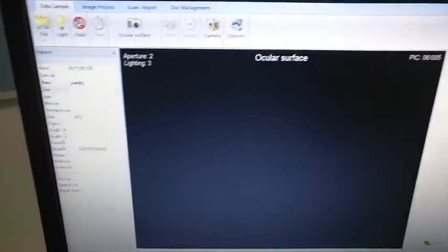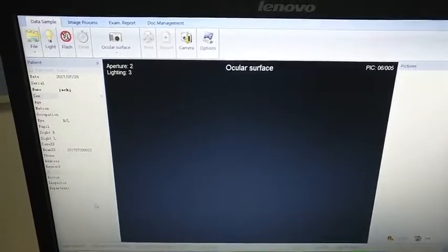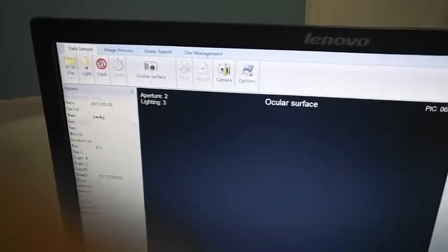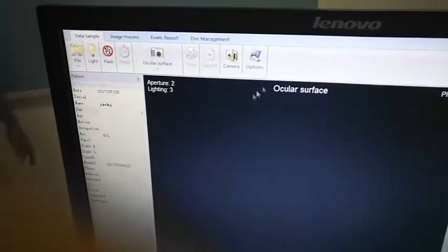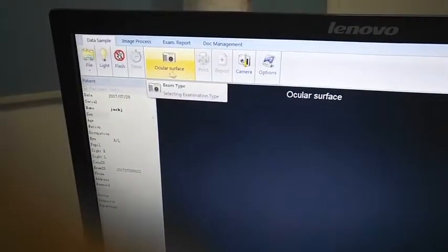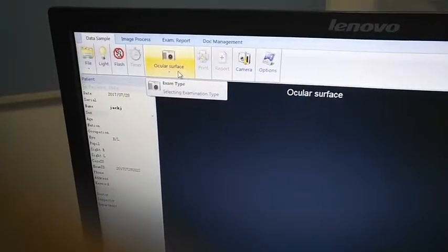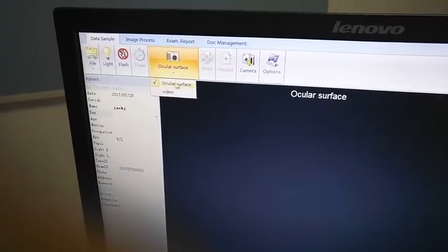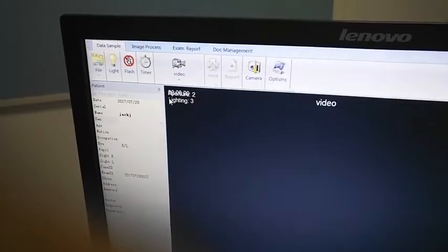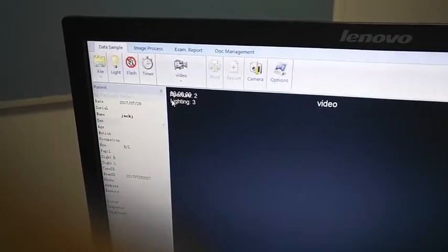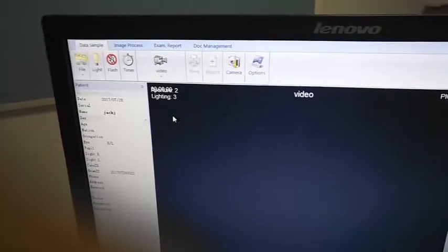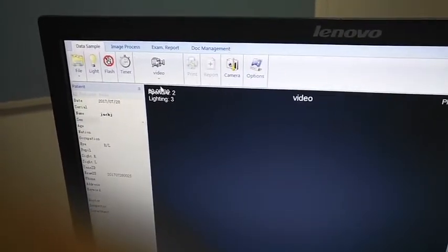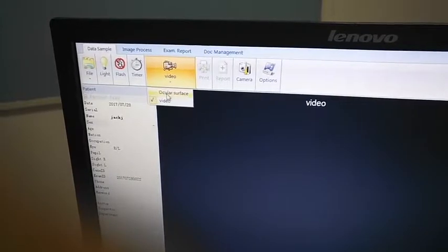This is our software interface here. You can choose here — this model is the Akuna surface, this is for taking a picture. This is the video mode. If you want to take a video, you can choose here, then you can make a video.